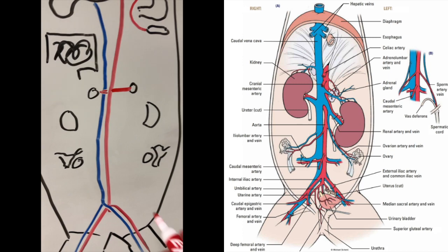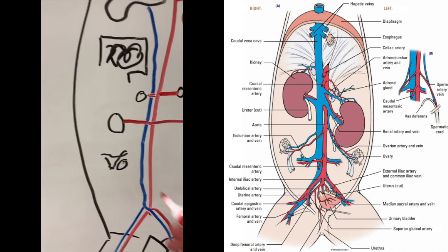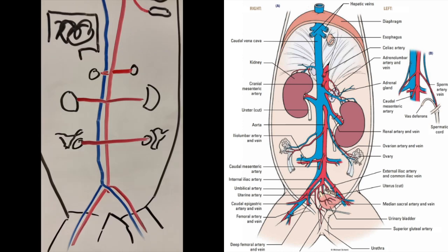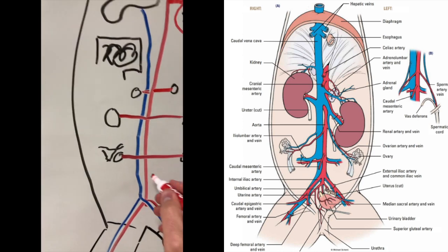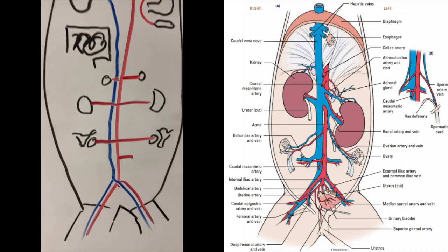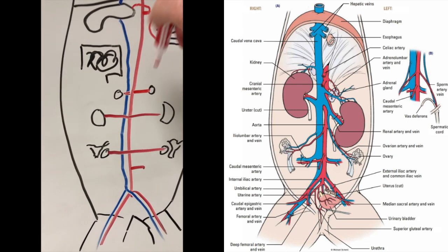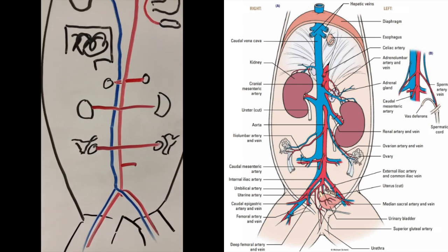So we've got the adrenals, and then we have the renals or the kidneys down here. That's also another matched set. We've got the gonads. It's another matched set. We've got the inferior mesenteric right there that feeds kind of the large intestine. We're going to represent the colon being up here for purposes of the hepatic portal system, so we'll kind of ignore that.